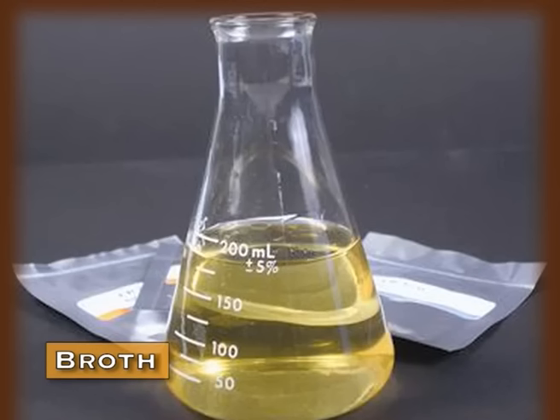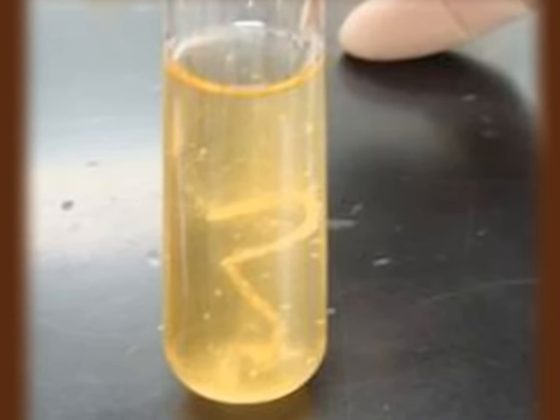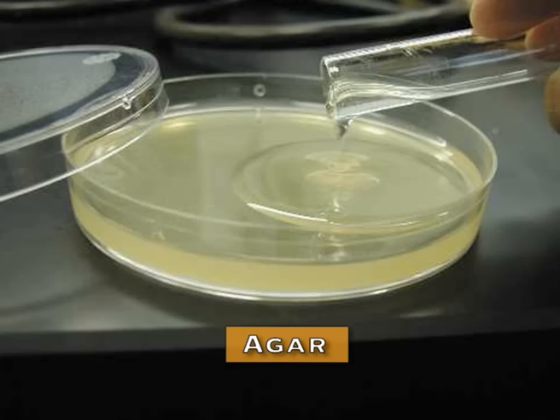Let us come to the first system of classification of culture medium, that is consistency, which means the physical appearance of the culture medium. If the culture medium is liquid in nature, then it is known as broth. The liquid culture is done when we require a large population of bacteria in a small defined period of time. The solid medium is made by addition of agar. Agar generally is added at a concentration of 1.5 to 2% to the culture medium. It is then sterilized by means of an autoclave.